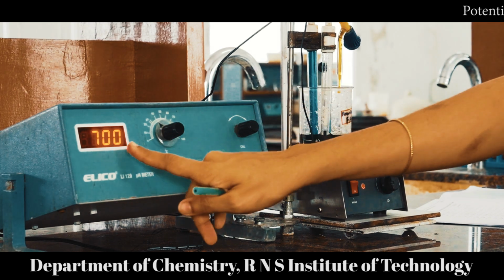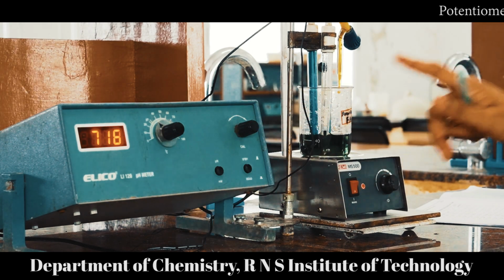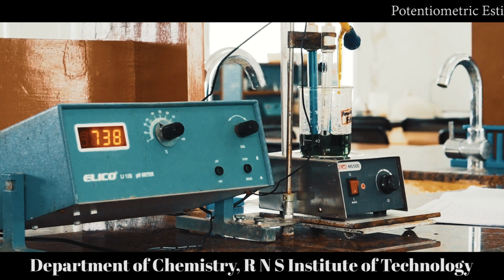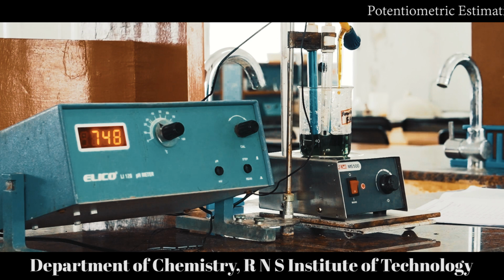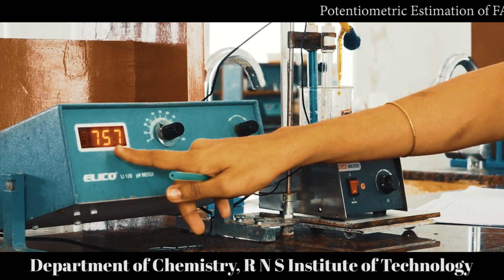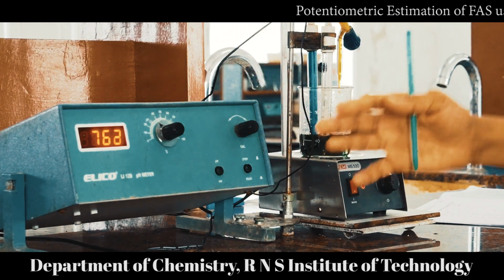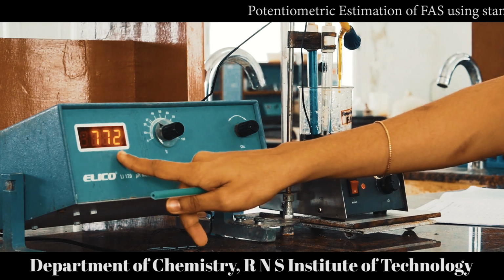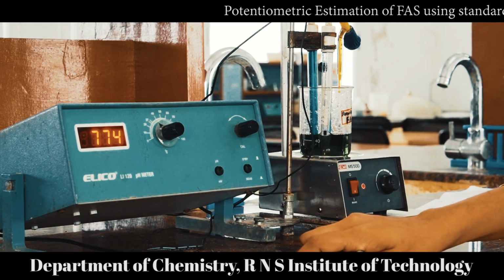Look at the potential value now. The previous value for 5 ml was 455, and now when I added 0.5 ml, that is 5.5 ml, the potential value is drastically changing. It is increasing drastically. This jump in the value indicates the equivalence point.